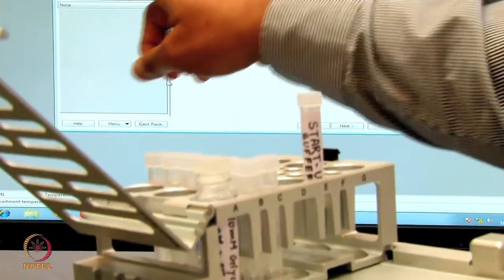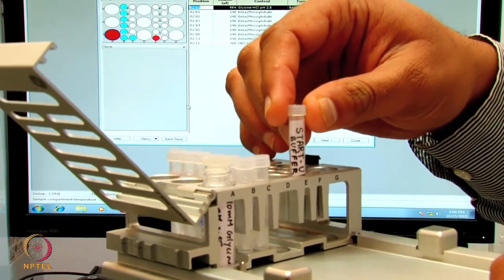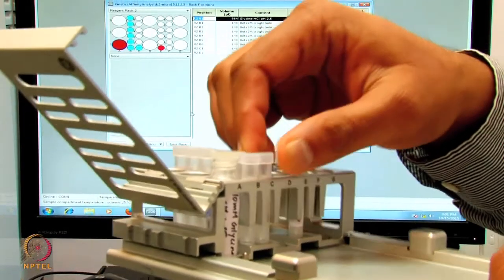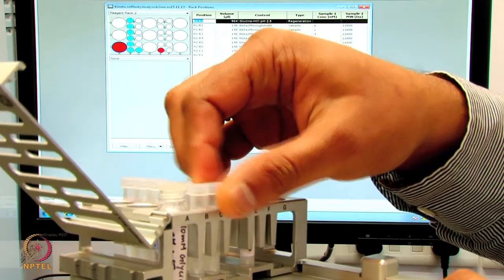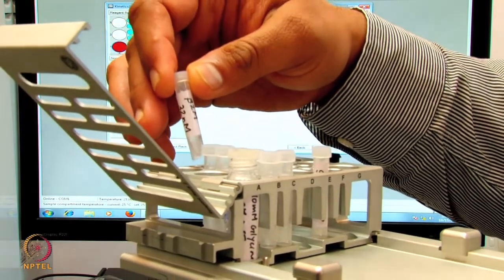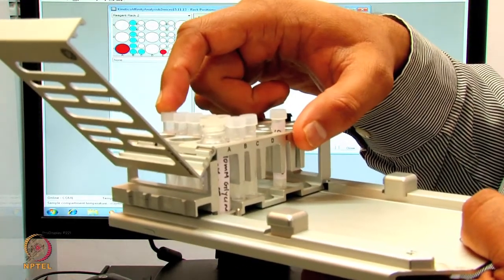So from the template here, we have prepared the sample rack with the different vials. To start with, we have startup placed at E1 position, and we have the different concentrations of beta 2 M with the concentration mark from positions at C1, B1 to B6.